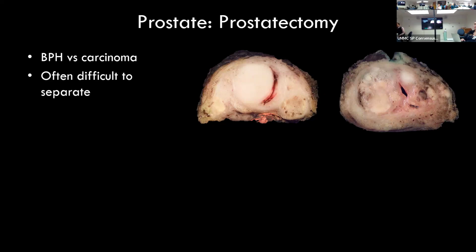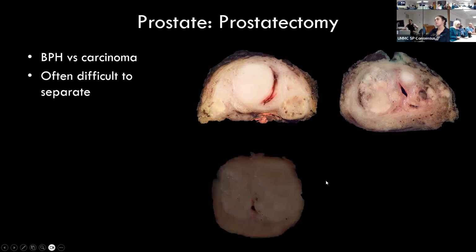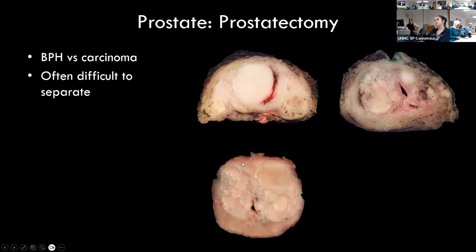It's whitish, so unlikely to be cancer. In here though, I can say that that's probably BPH because it looks like that. And these ones are probably cancer, okay? But you can't really be completely sure. In this case, I can say this is probably BPH.